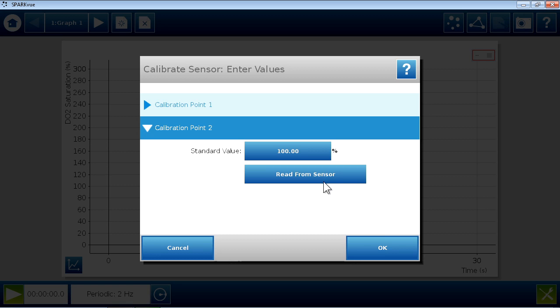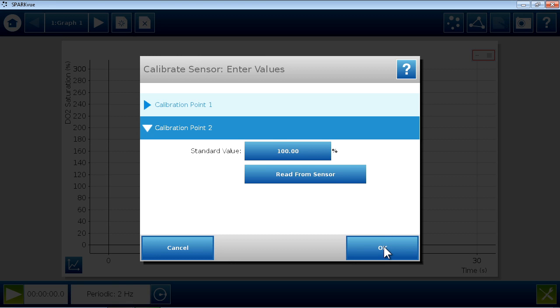The sensor is now calibrated and after exiting this menu, we can proceed with the experiment.